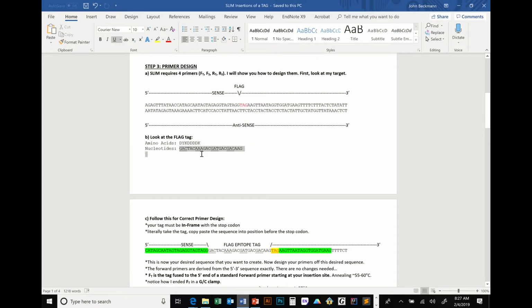So how would I choose what the sequence is going to be? How would I choose that? Does that make sense? Like, if there's 4 codons for a particular amino acid, I don't know if there are 4 for D, but let's say there were. How would I know what to make my sequence? Does it matter? Yeah. You're going to want to check the organism. So I don't want to put something that's a bunch of bad codons.